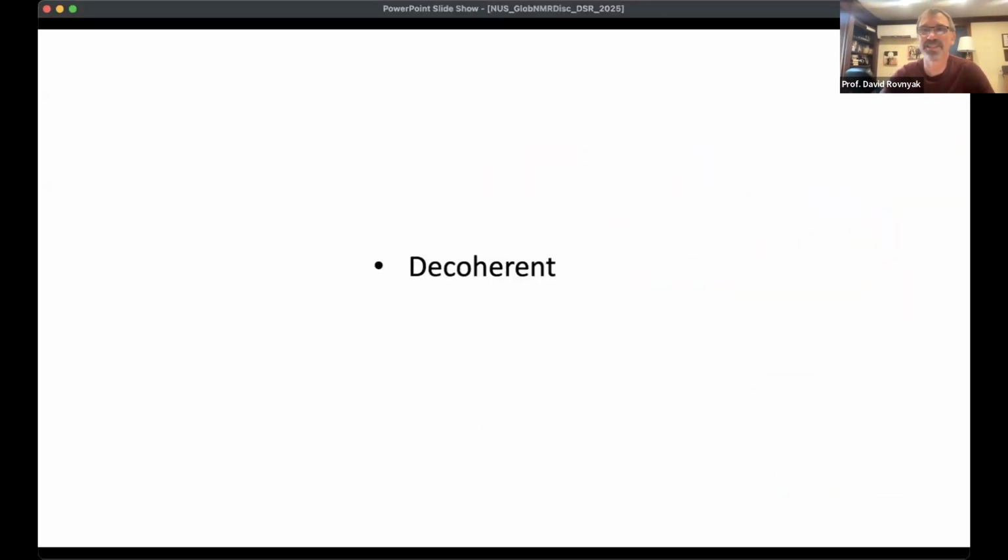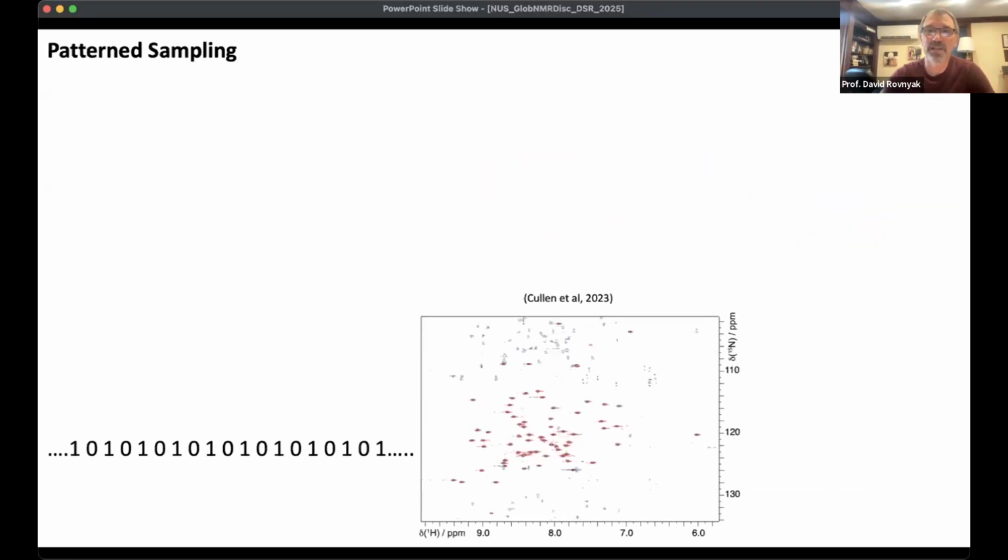And so that takes us into decoherence, and that's consumed us for a few years. So here's a related example of an HSQC that actually has an intentionally very, very bad subharmonic sequence in the sampling schedule that's every other point. So this portion only has half the spectral window of our actual grid, and it's actually given us mirrored peaks.